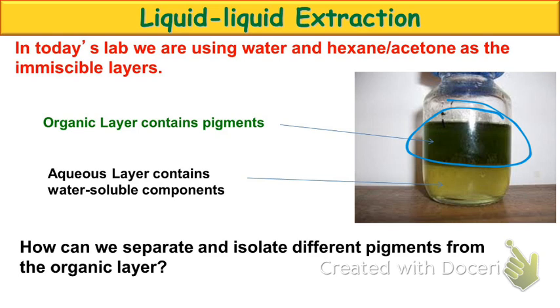So if we looked at TLC, and I use my thumb and finger here as an example, my thumb would be which compound on a TLC? What could you tell me about the thumb versus my index finger or my pinky? It's going to be the least polar compound. If I now go through and look at column chromatography, what do I need to do? I take my TLC plate, turn it into a cylinder, which I can't really do with my hand, and then turn it upside down. Which compound comes off the column first? The least polar compound. Okay? The one with the highest RF.